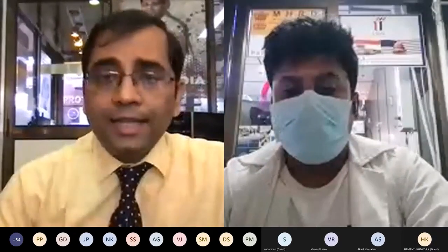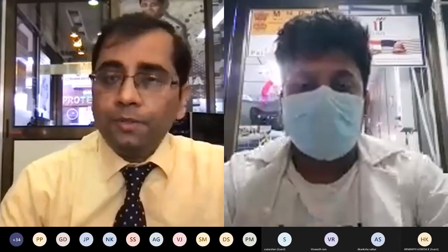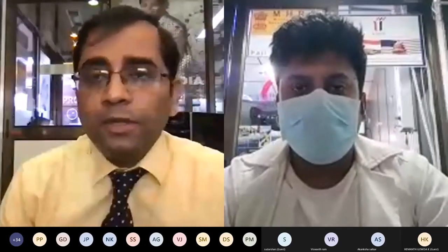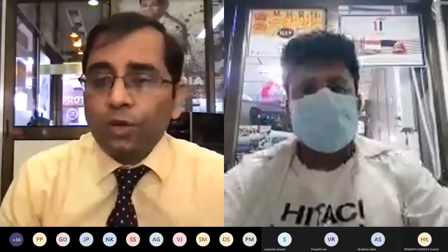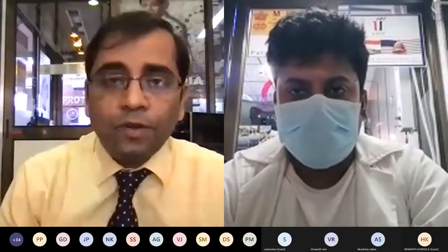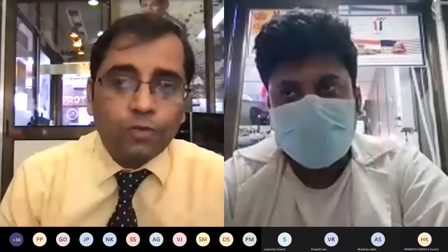Today's session, and of course the subsequent post-lunch sessions, are going to be more interactive, with more interaction with the software, and we will see how much we can do. If one software takes longer, we can maybe show the other software tomorrow, but we would also like to give people an idea that there are different software which can do the same thing but with slightly different output. That's the reason we gave all of you the same data file to be analyzed with one open access software and one commercial software. But if the time is not sufficient, I think we may restrict to only one software.